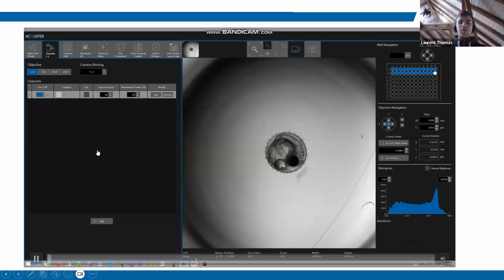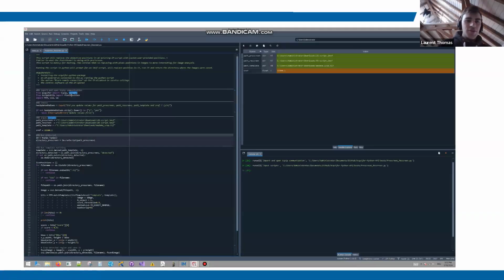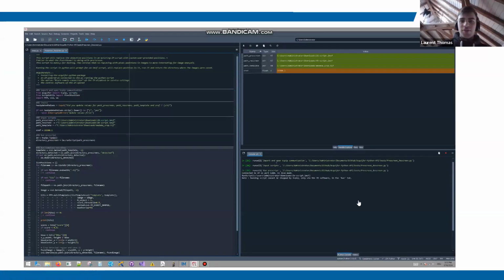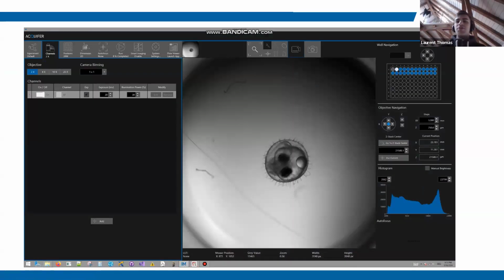So this is, as I said, the view of the software. Then I jump into Python, running the import, and that's not really important. Loading the template file. So here I'm highlighting that I will run the prescreen script. So there we go. So you see that this runs, and now the prompt didn't return. It will wait until the acquisition is over.